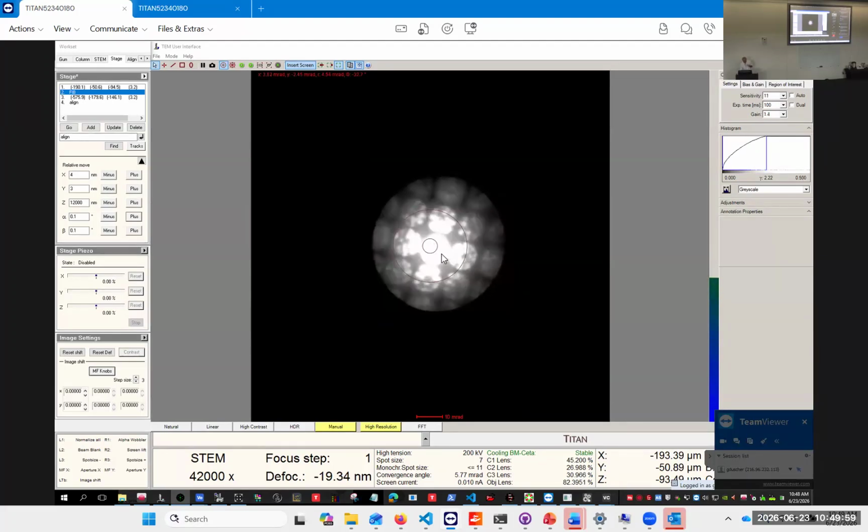The other problem that we have with these conditions is that our Bragg spots do not overlap anymore, and the overlapping of the Bragg spots is actually what gives us our atomic resolution. So at the moment we have very limited resolution, so we can try it. We have a lot of contrast on here.